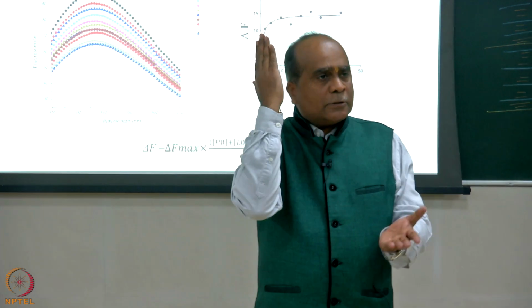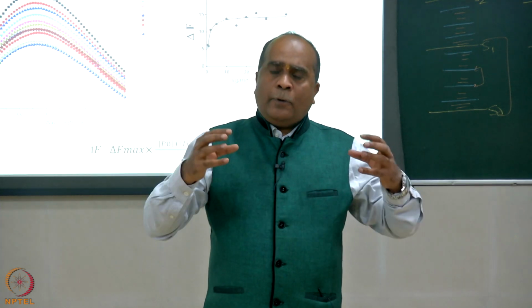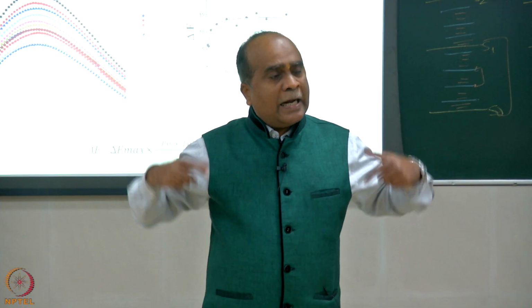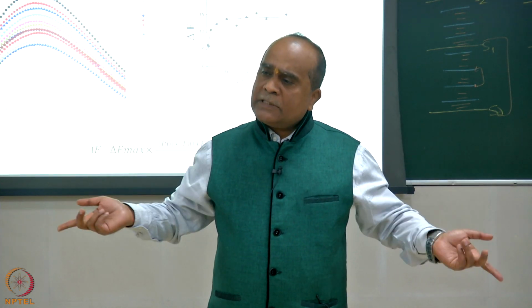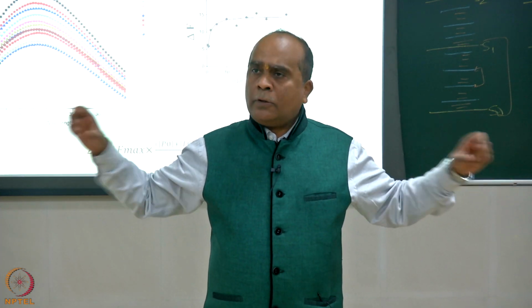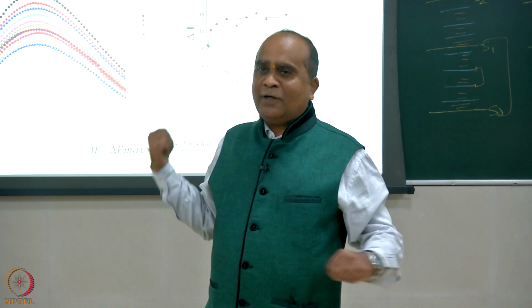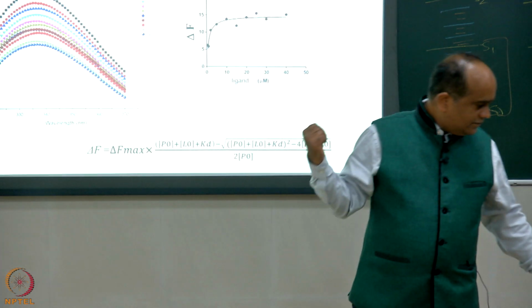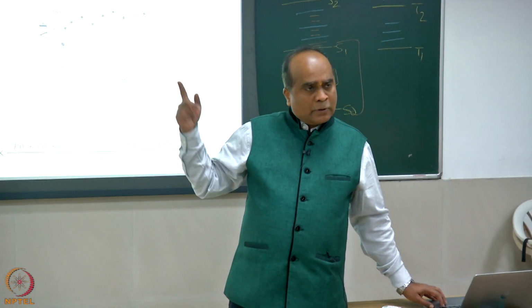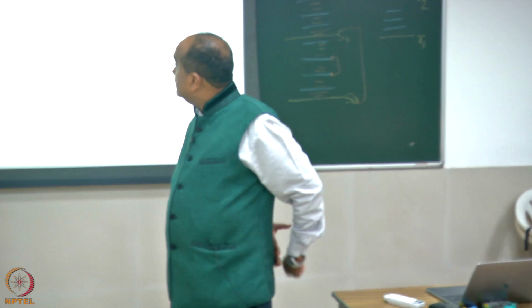So, suppose this drug binds, it changes the conformation of the protein. Now, for microtubule to form, you require a certain conformation of the protein. That conformation has been altered, so the microtubule binding capacity is decreased or lost. So, it will not form that rope which is used for the tug of war during cell division. That is the way it is happening. The fluorophore is there, but its microenvironment has changed, that is what is happening here.